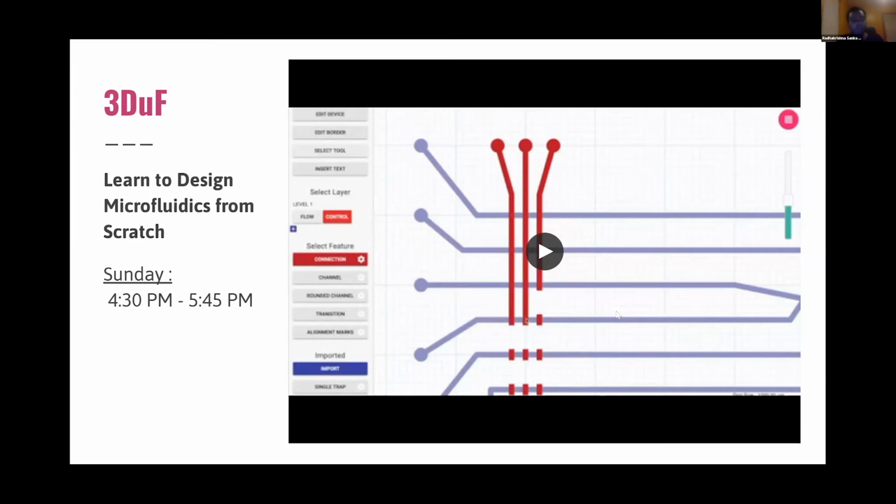As part of my research work, I build open source design tools for engineering microfluidic devices. What this basically means is I look at how microfluidics engineers actually work, distill what is necessary out of all the science and engineering, and create automated pipelines.